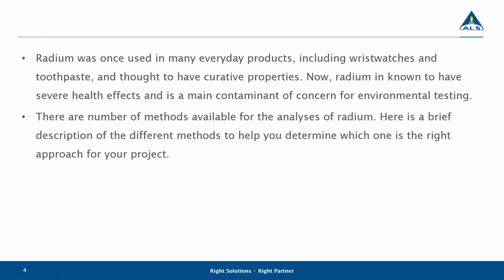Now, radium was once used very commonly. Wristwatches, the little old glow-in-the-dark dials, that was from radium, and it was put into toothpaste, and it was thought to have curative properties, and people were encouraged to consume things that had radium in it. Nowadays we know radium can have very severe health effects, and would never advise any of that, and it becomes a concern for environmental testing. There are a number of ways to test for radium, and we're going to talk to you about some of the different methods that are out there so you can try to find the right approach for the project you are doing.